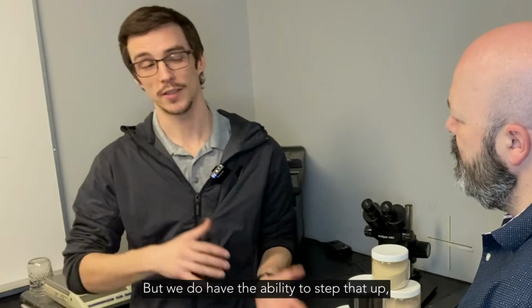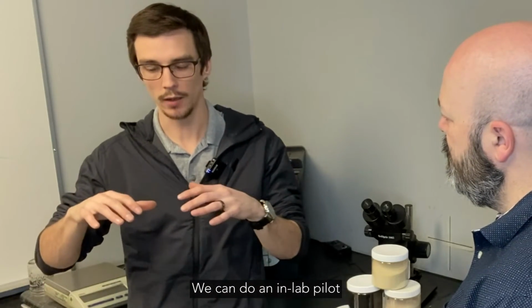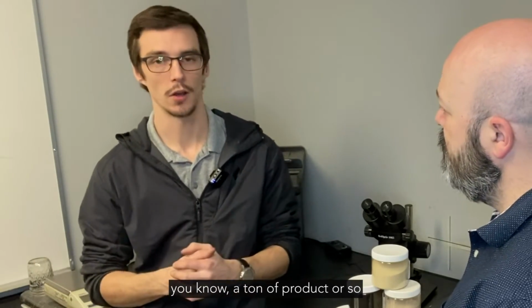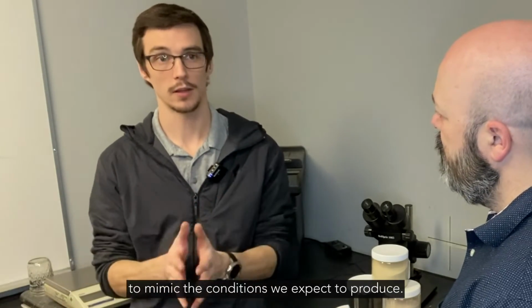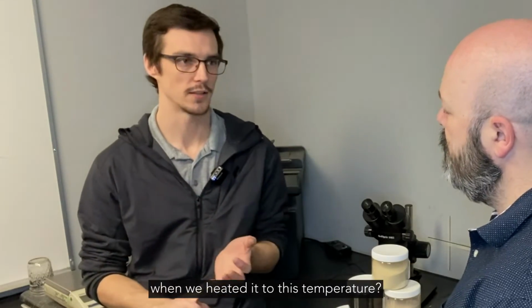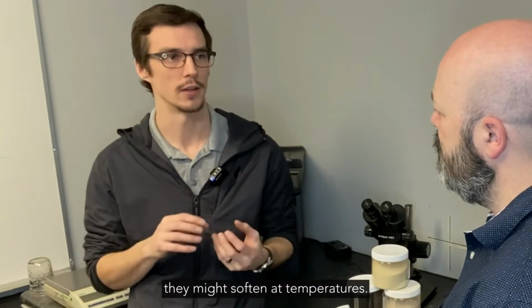But we do have the ability to step that up, particularly in heating applications. But we can do an in-lab pilot with a much larger sample. We'll have times where we might get a super sack, a ton of product or so, and run a continuous representative pilot to mimic the conditions we expect to produce. And we can validate things like how much moisture did we actually drive off the product when we heated it to this temperature, or did it get greasy, or certain products we're worried they might soften at temperatures.